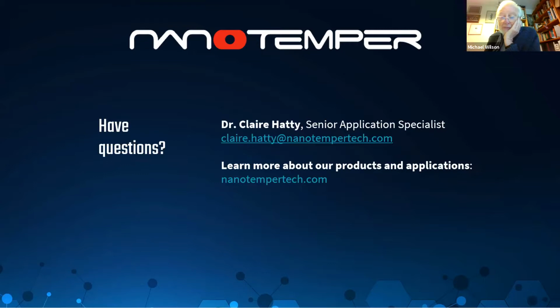You wouldn't have to do very much, but you have to do something different with the analysis, probably. Yeah, and then, for example, if you have something that shows cooperativity, you can fit it differently. You could fit it with the Hill model instead, and then we get an EC50 rather than a KD. So you can do that. Okay, yes, we can do that. It is very dependent on that exact situation, which is why we report an EC50 rather than a KD. Yeah, I get you.